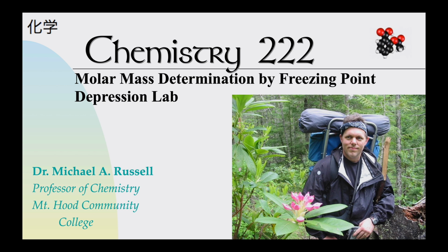So this is a lot more versatile than the volatile liquid molar mass process. It can be used for a lot of different things. And also there's the boiling point elevation type problems, which are similar to these. This is a pretty cool technique. So anyway, without further ado, let's get into the lab.